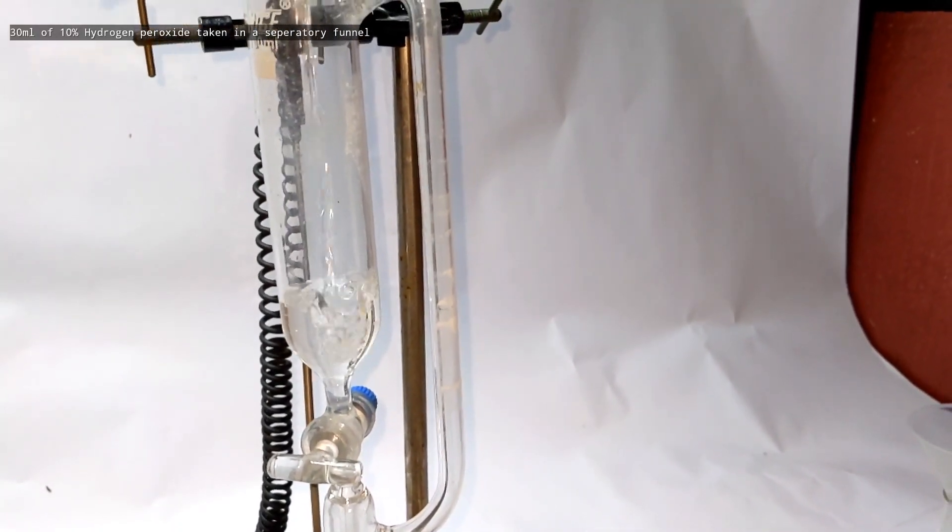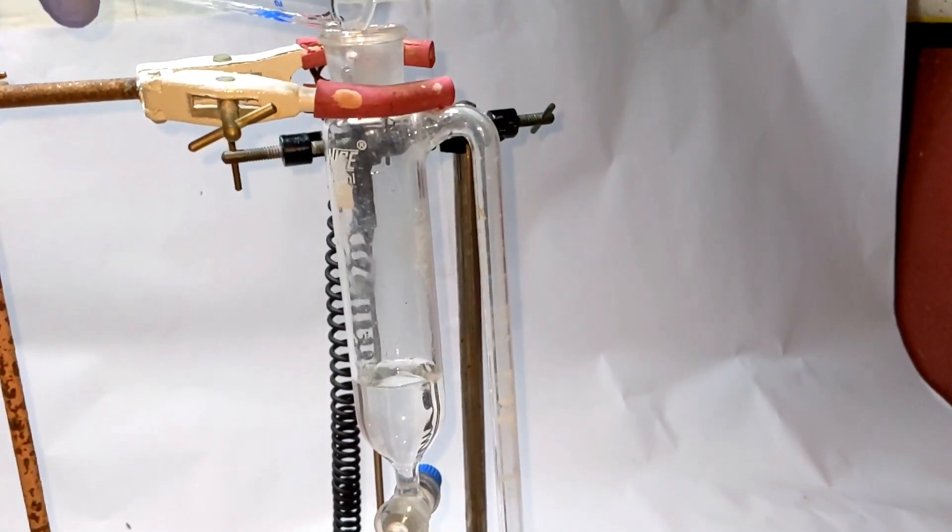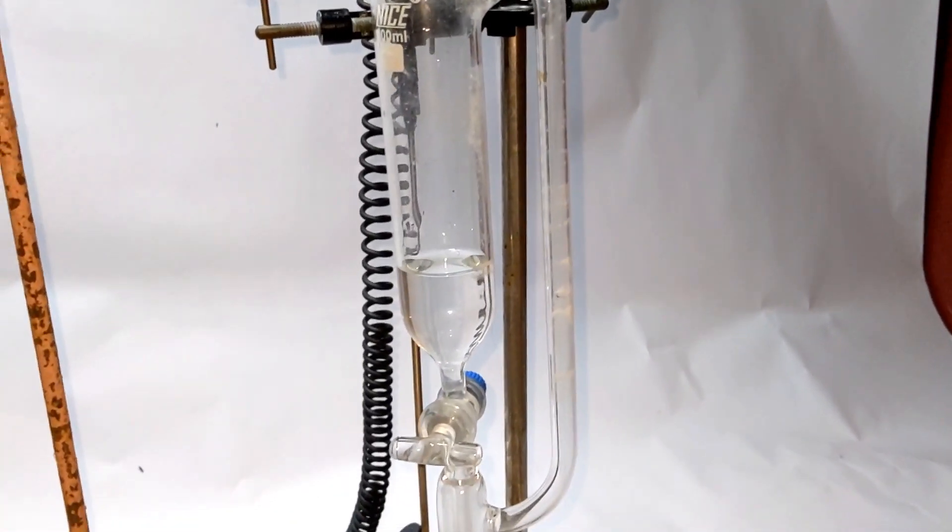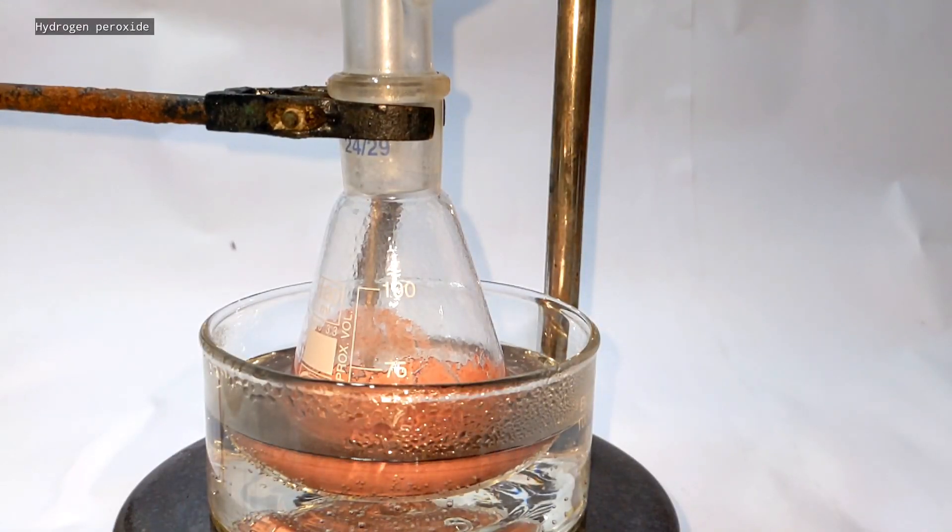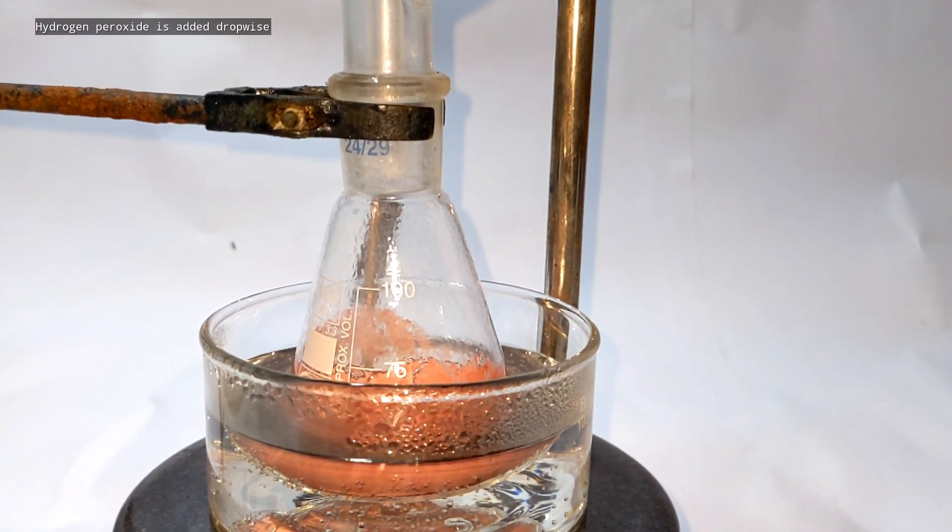30 milliliters of hydrogen peroxide solution was added to the pressure equalizing funnel. With simultaneous heating and stirring, hydrogen peroxide was allowed to fall into the mixture.